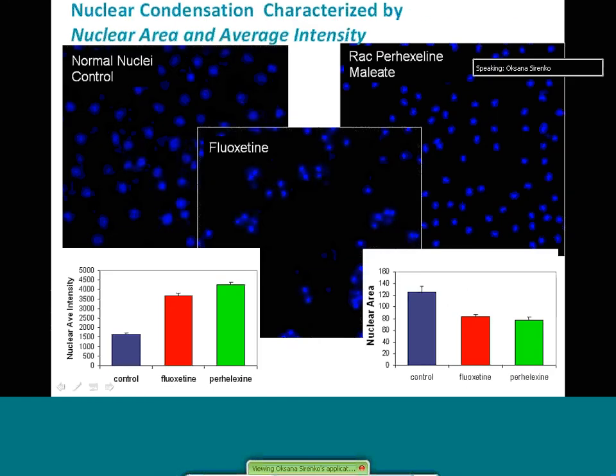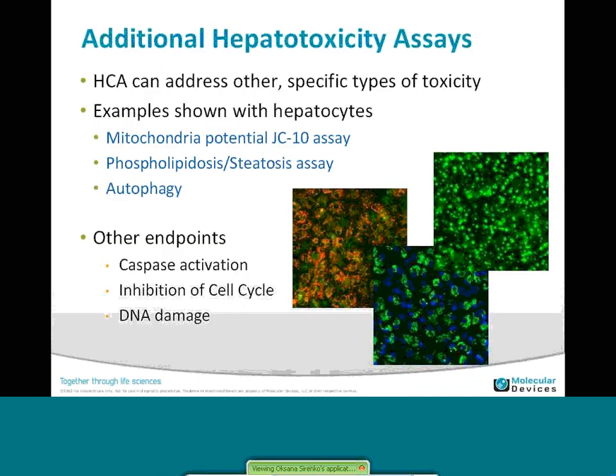There is another example which you can see in enlarged images of nuclei of cells treated with different compounds. And those actually pretty subtle changes are reproducible and statistically significant. So in addition to cell count and marker intensity, those parameters like characterization of cell area or nuclear shape are very important for defining hepatotoxicity and can be used as an additional readout which provides additional information.